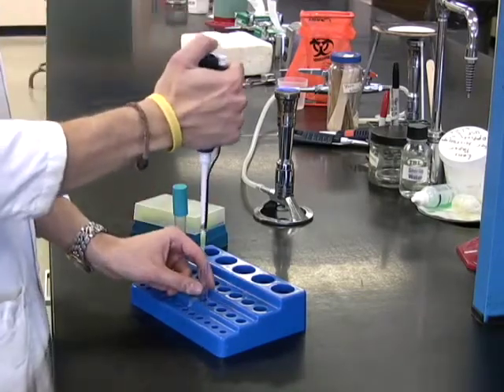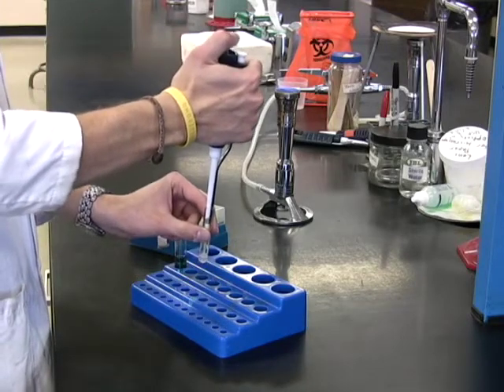In the 55 degrees Celsius water bath, you will find a tube of Snyder Test Agar. Take that to your bench.